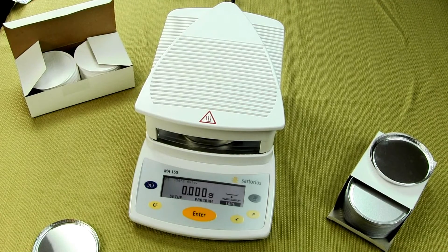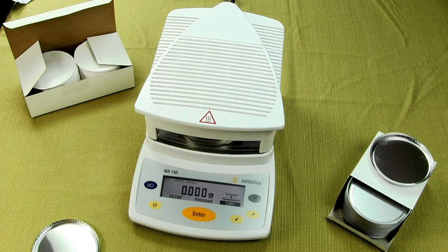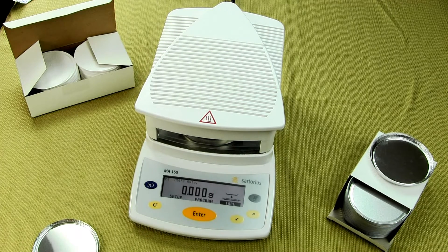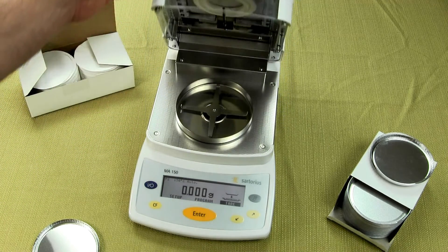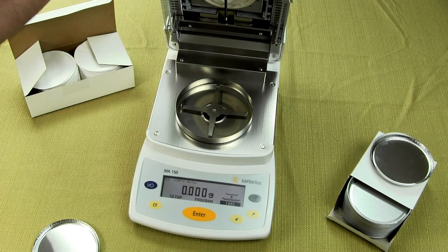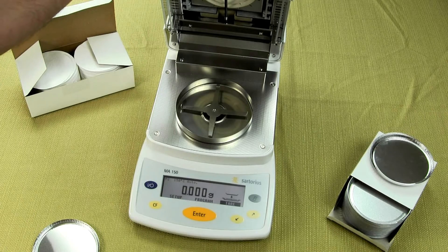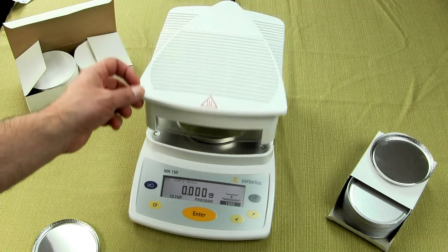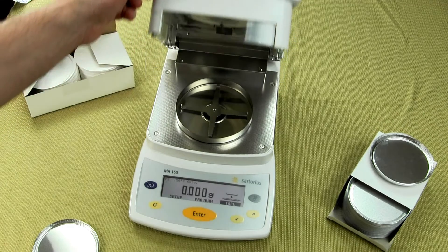Welcome to Precision Weighing Balancers. We'll be showing you today the Sartorius MA-150 Moisture Balance. This moisture balance is extremely simple to use. It is designed and engineered in Germany. Sartorius has been building balancers for over 140 years and they are the premier manufacturer of balancers.